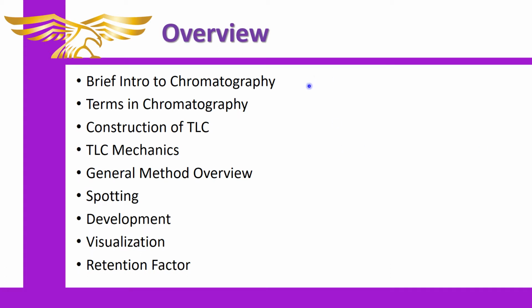We'll begin with a brief intro to chromatography. We'll discuss terms relevant to chromatography, discuss the construction of TLC plates, discuss the mechanics of TLC, discuss the general method that you'll use and condense that down to an overview. We'll discuss spotting in detail, we'll discuss development, discuss visualization, and discuss how to measure and calculate retention factor.